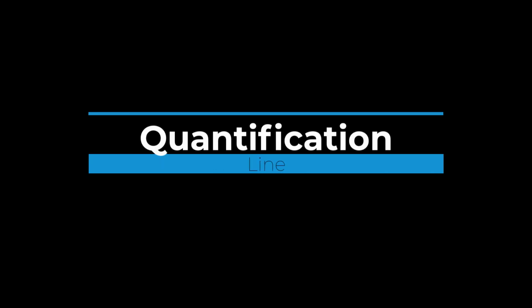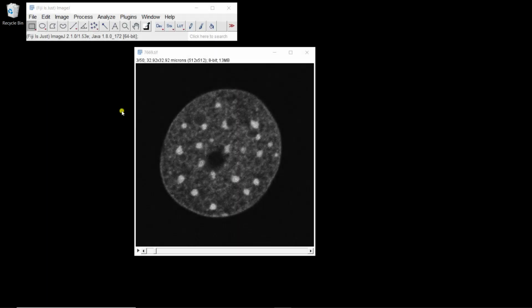In this video, I'm going to show you how you can quantify intensity and distance along lines. So we consider this image sequence which represents our cell. It was a cell that was acquired where histone H1 were tagged with GFP. And so at time 3, there's a FRAP experiment. FRAP stands for fluorescence recovery after photobleaching.